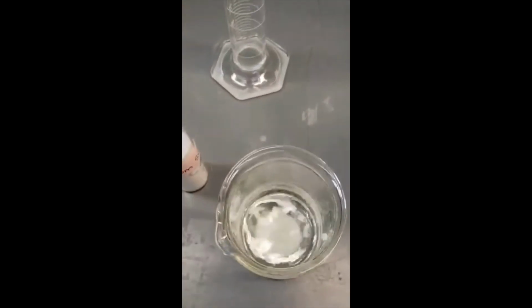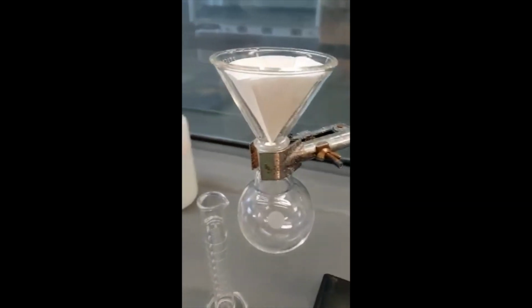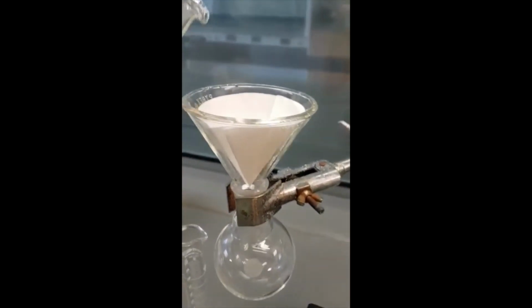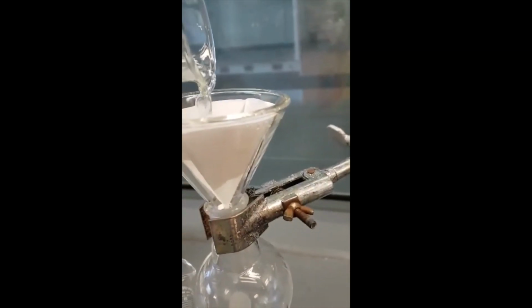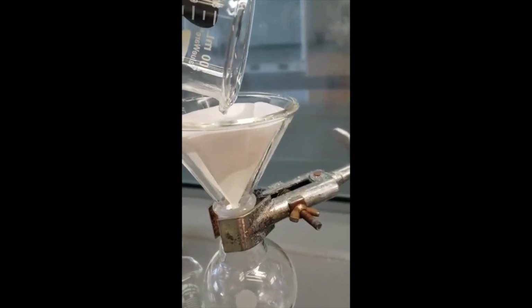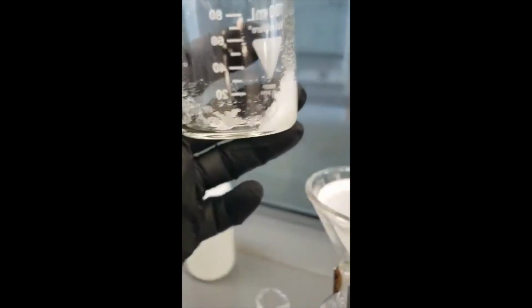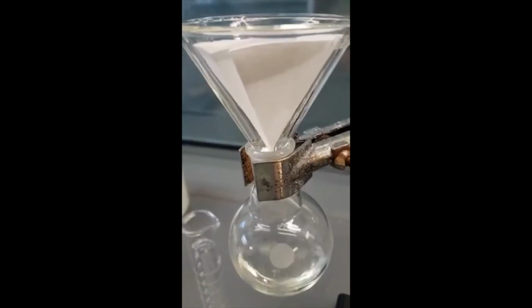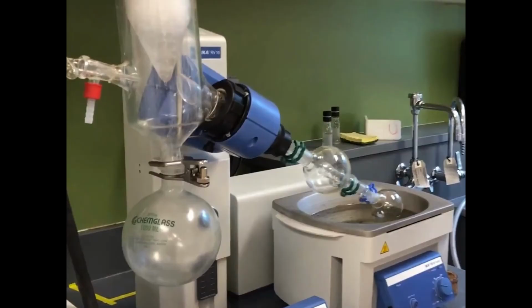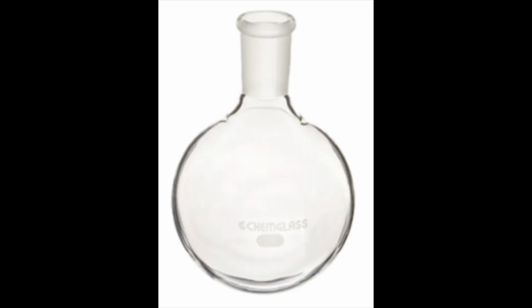When you're done with the 15 minutes, pour the mixture using gravity filtration into a pre-weighed round bottom flask, leaving the sodium sulfate behind and collecting through gravity all of your methylene chloride fractions. Once all of the methylene chloride has dripped through the filter into your round bottom, we will head over to the rotovap. Your instructor can help you here, but what the rotovap does is evaporate off all the solvent, leaving your essential oil behind. Once the solvent is evaporated, take the mass of your round bottom with your essential oil in it. That will provide your yield.